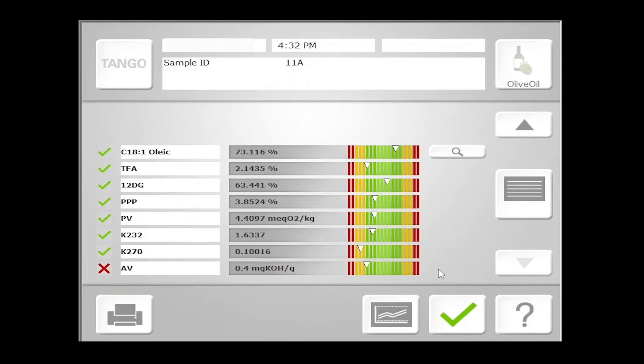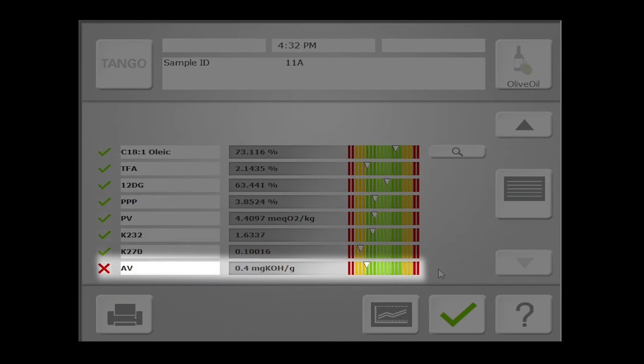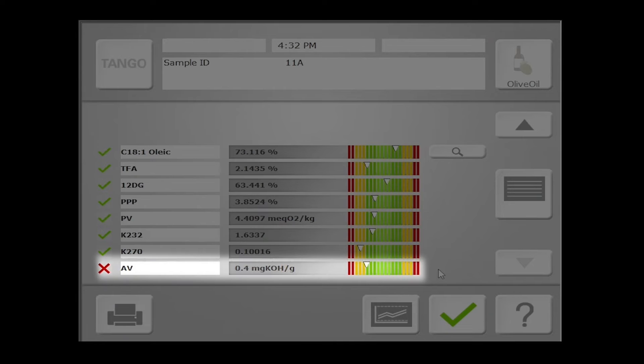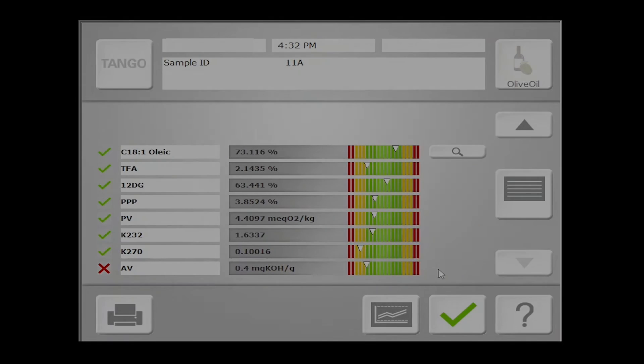If we scroll down, we'll see that our AV, or acidity value, falls below that 0.8% threshold that is the main criterion for the classification of olive oil as extra virgin. However, you'll see that's giving us a red X despite falling within range, signaling that the sample didn't meet all the statistical thresholds set by the calibration and requires further analysis.